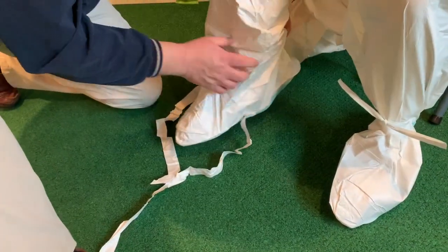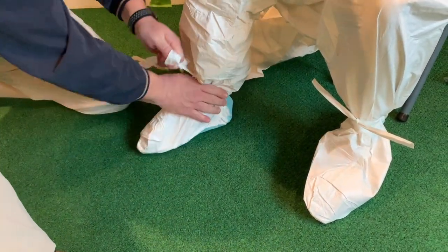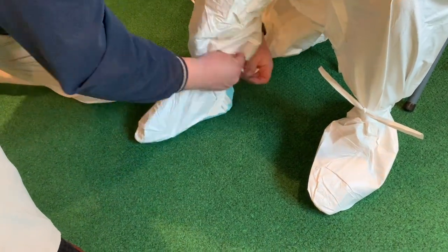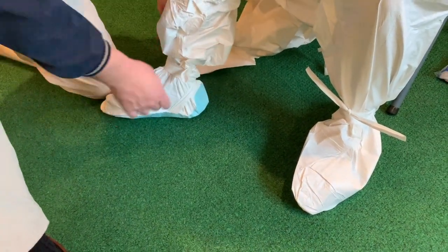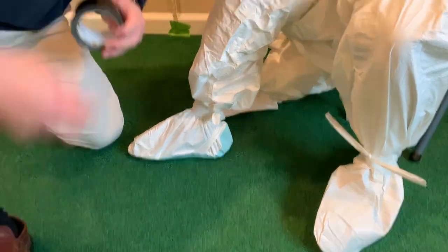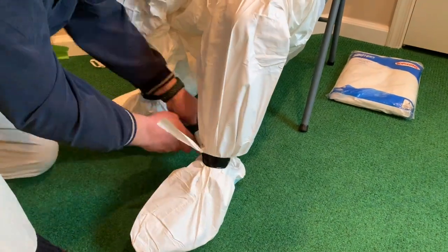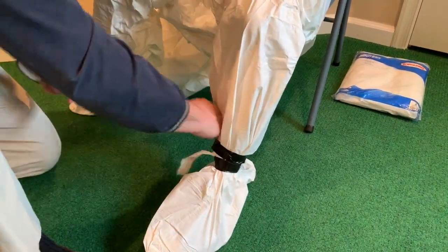If you do not have laces on your coveralls, you can also use duct tape as shown in this portion of the video. Here we are duct taping the coverall ankles, but it is really not necessary because we had shoe covers.